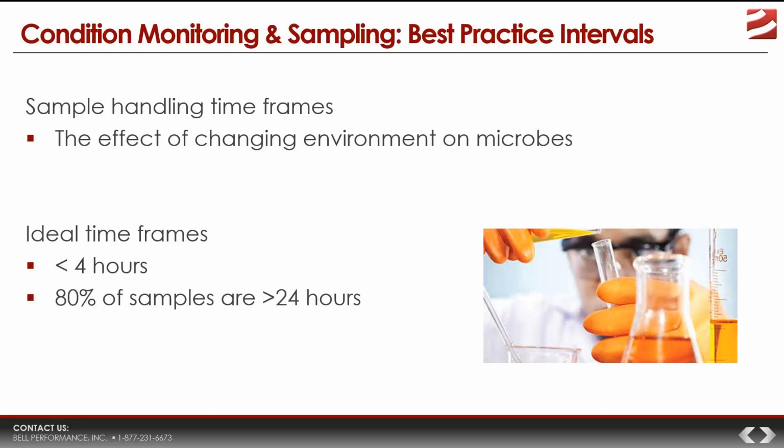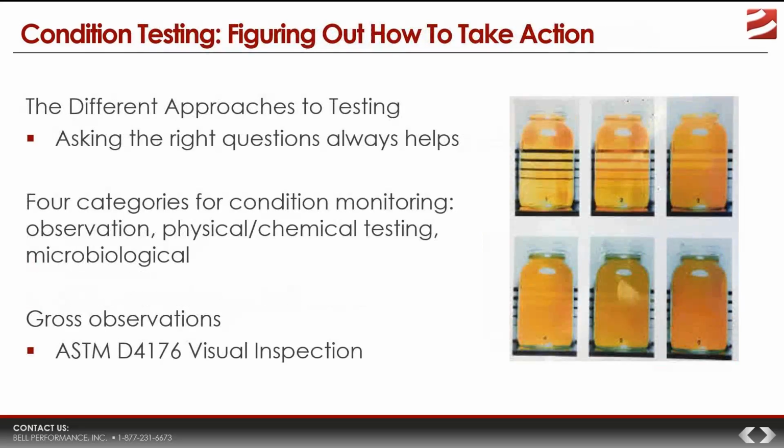Now, again, remember we said dispenser samples aren't going to be useful because they don't really show microbial presence. The reason is that dispenser samples tend to filter out the water and the rag layer. Now, if you can get a dispenser sample where microbial presence shows up, then what you can take to the bank is that the system is really, really bad, because the system really has to be tremendously overwhelmed with microbial growth for it to show up in a dispenser sample.